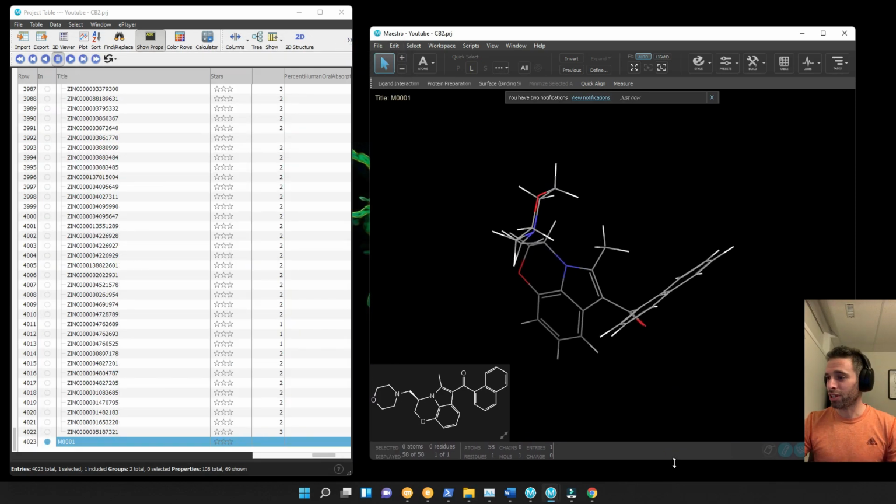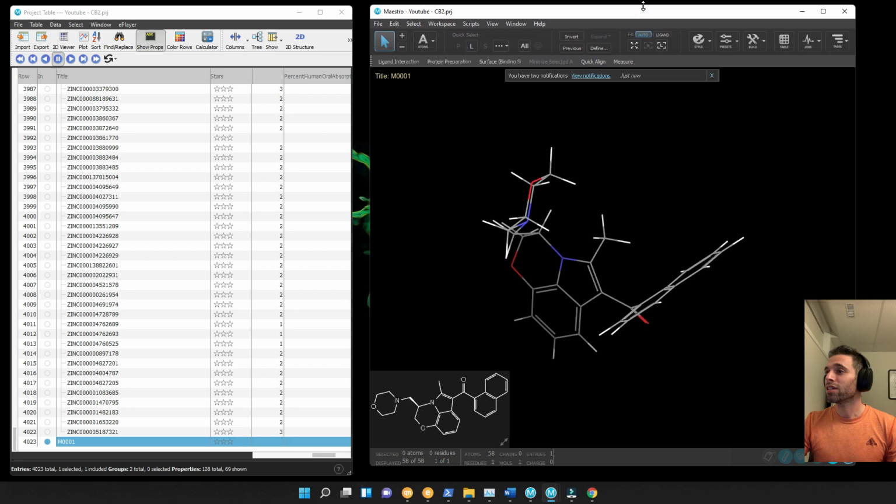And I am curious. I want to go to Table. I also want to rename this as WIN 55212-2, and we could also put next to it, this is our control compound.